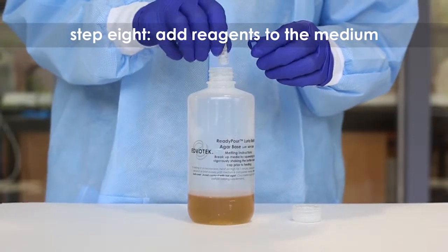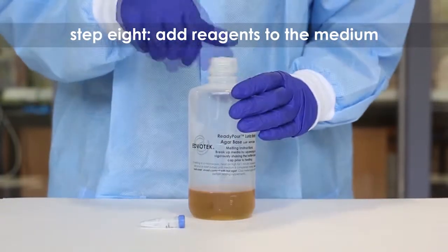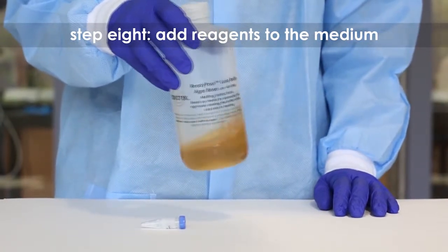Step 8: Add any media supplements to the remaining ready pour agar, such as antibiotics, as specified in the protocol. Recap and swirl the bottle to mix. Only add reagents to the cooled medium.